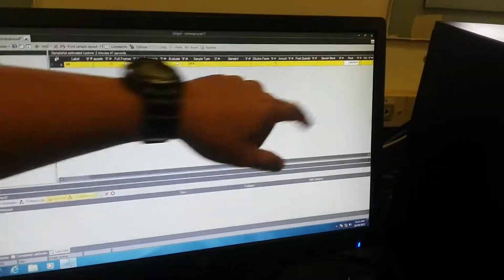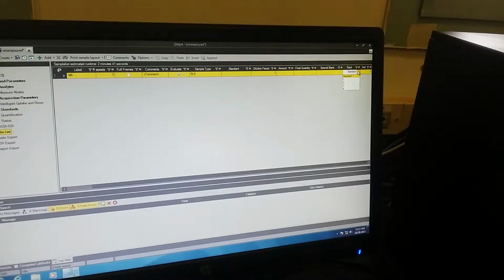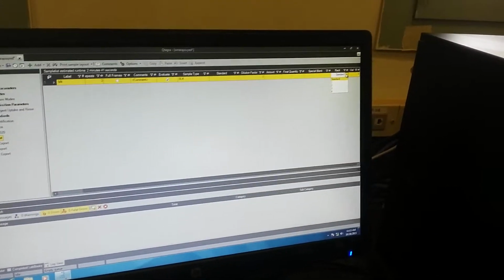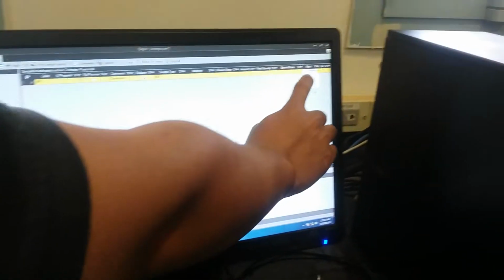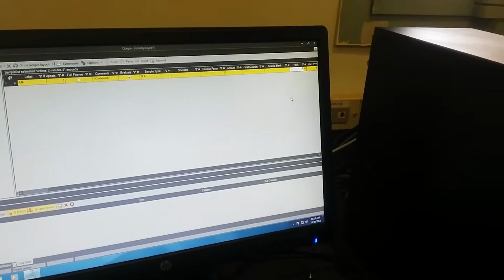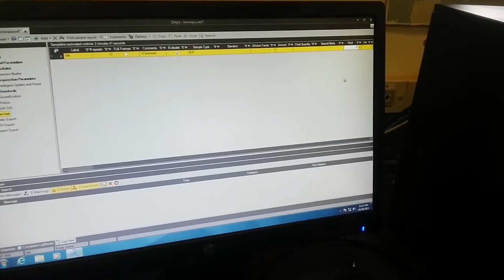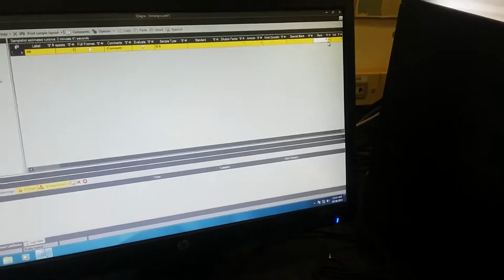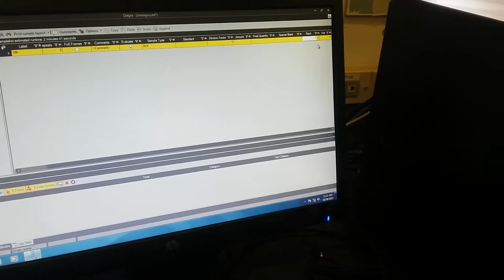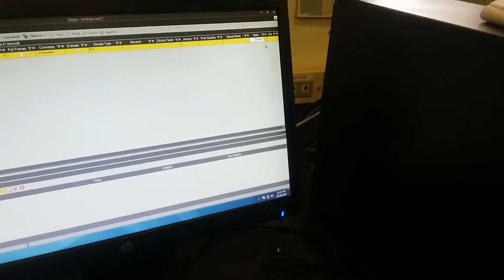So here now we will define the rack. What does standard mean? Because here we have standard 1, 2, 3, 4. No, this is the rack, 1, 2, 3, 4. This is the standard. So you have to select, because this is blank, we will put blank here. Correct? And then standard, you have to put standard, and then position 1.